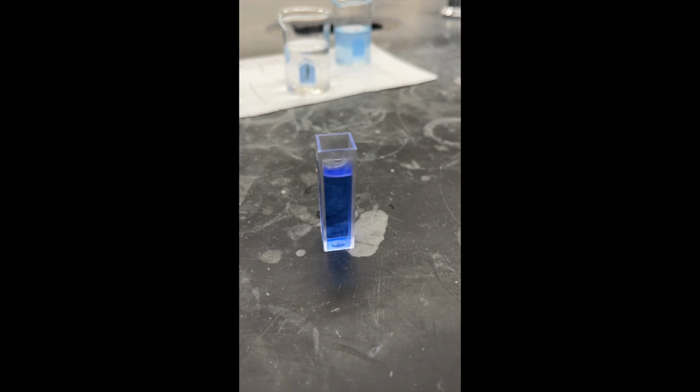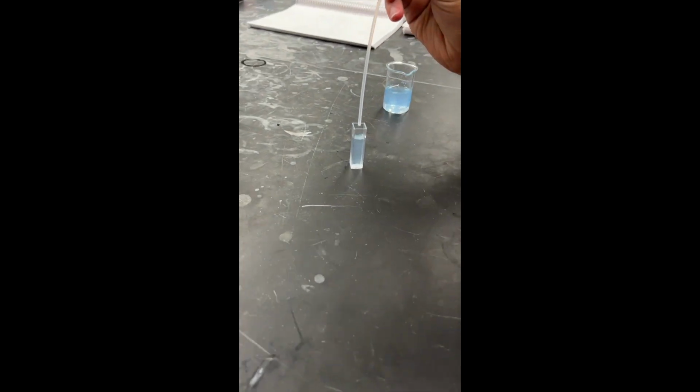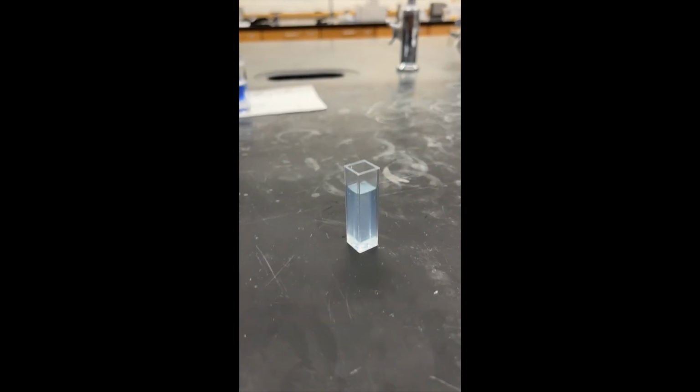To do this, we are placing the solution into a cuvette, which will then go into the spectrophotometer. We are carefully dispensing the solution into the cuvette using a transfer pipette up until the mark on the cuvette.